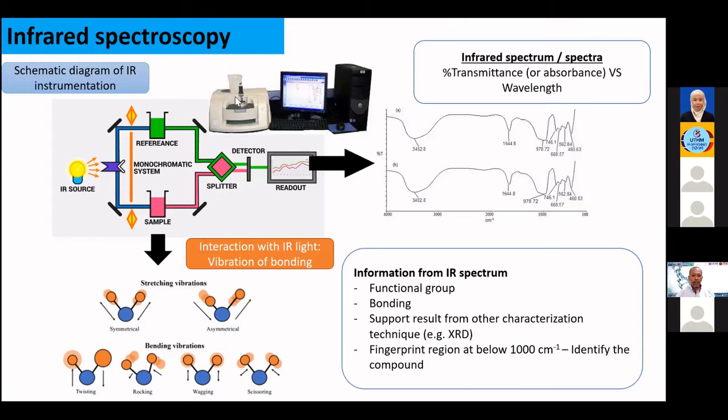From here, the computer will change it to the infrared spectrum. Okay, so we are now using the term spectrum for one spectrum, singular. And if there are two, we call them spectra. Spectra is the plural of spectrum. Not spectrums, it's spectra.